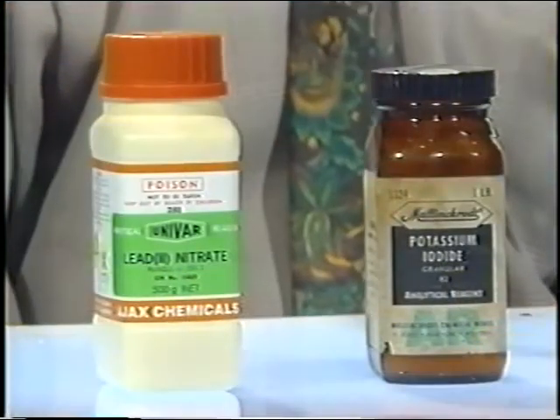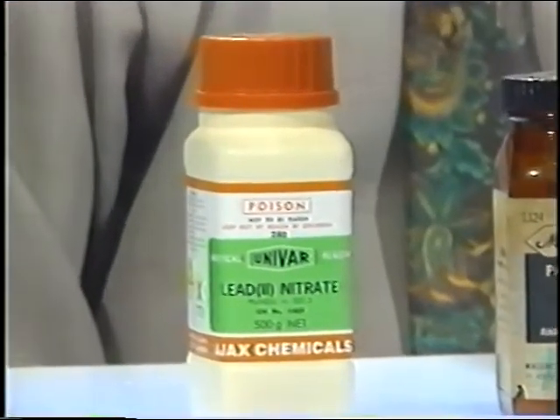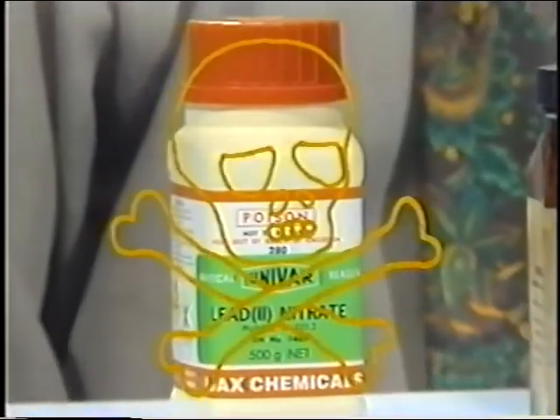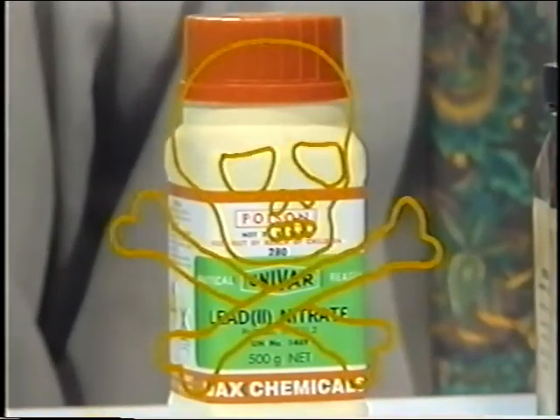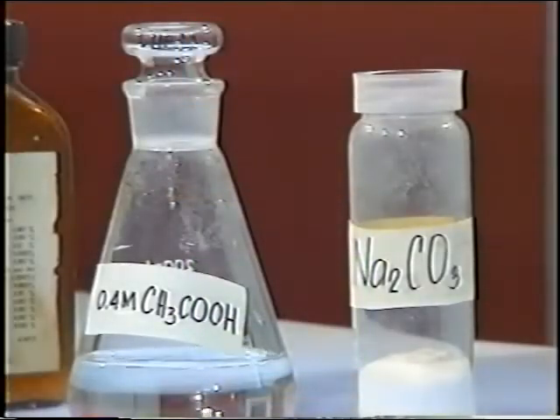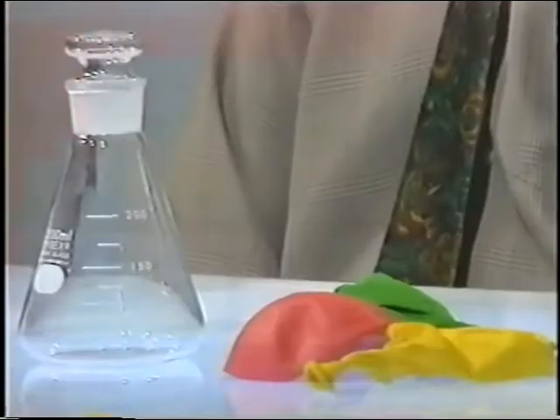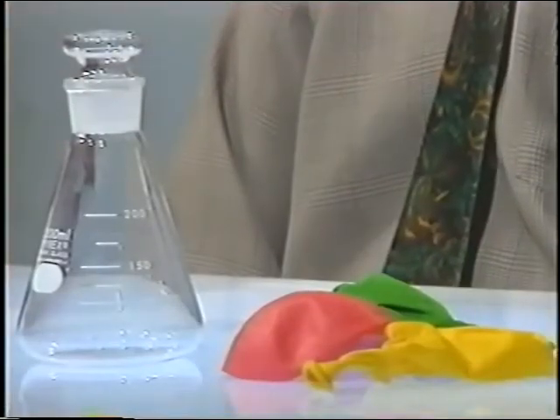Here are lead nitrate and potassium iodide. Lead and some of its compounds are toxic. Therefore, handle and dispose of these very carefully. We also have acetic acid and sodium carbonate. We need a digital balance that reads 2 decimal places, Erlenmeyer flasks, and some balloons.